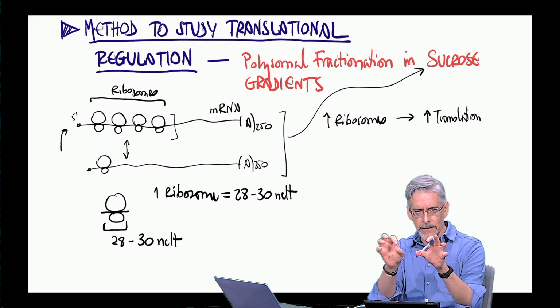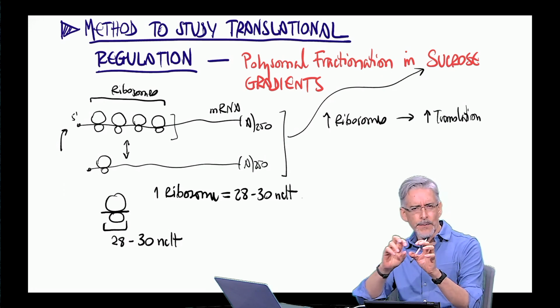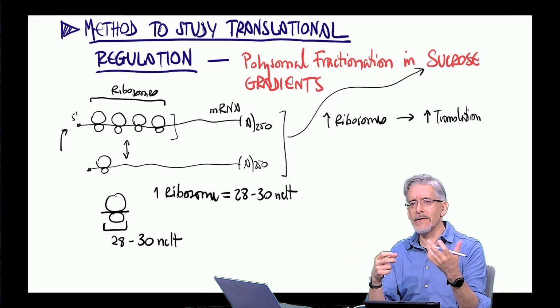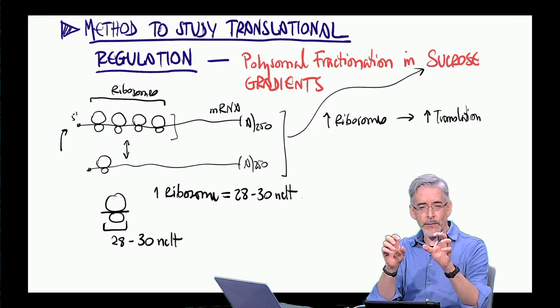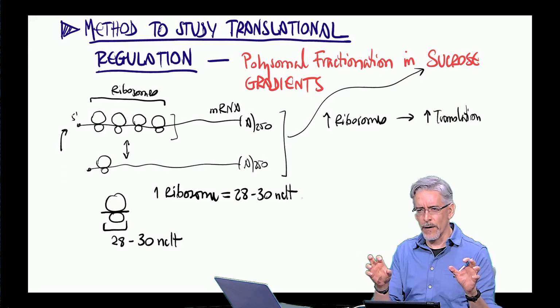If you have colliding ribosomes, you can easily imagine how one ribosome can actually push the other one, therefore forcing it to skip a few nucleotides, therefore affecting the reading frame that is being used for translation. So there needs to be some spacing between consecutive ribosomes, and that spacing actually can fluctuate.